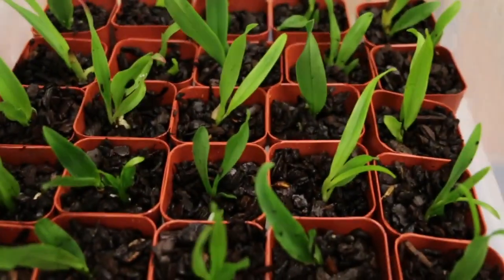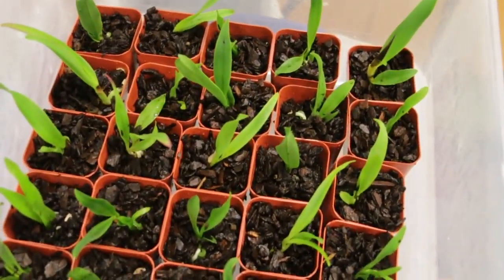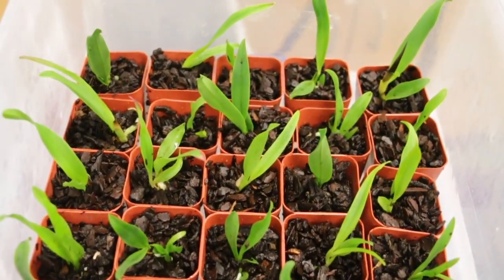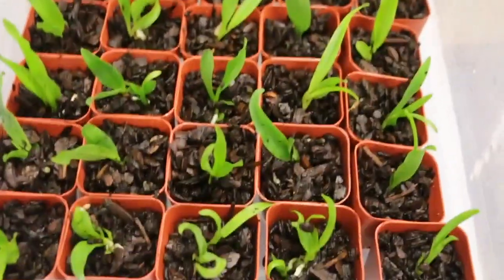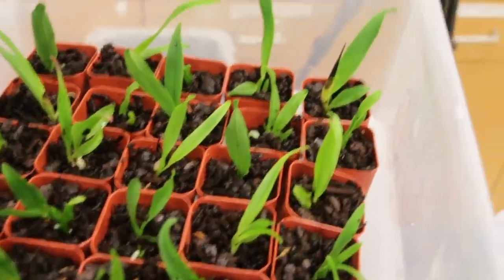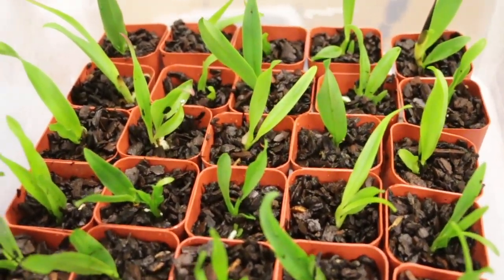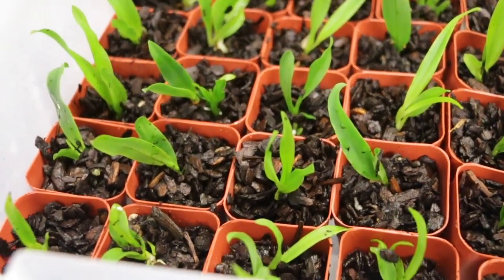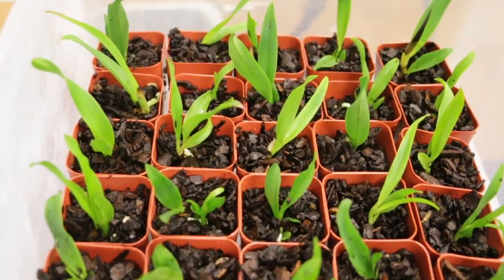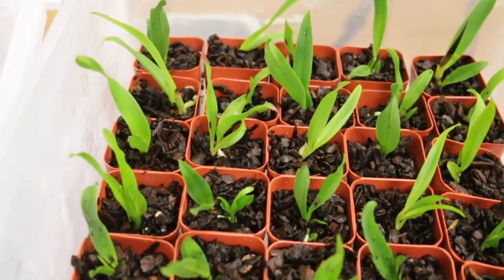So here's another tub that I did, and looks like there are 30 in here from another flask that I had, but I saved most of them from this one. I'll water these the same way, and then put them underneath the LED grow lights in the laboratory. And as I've showed you previously, I take all the excess water out and put new water in weekly.